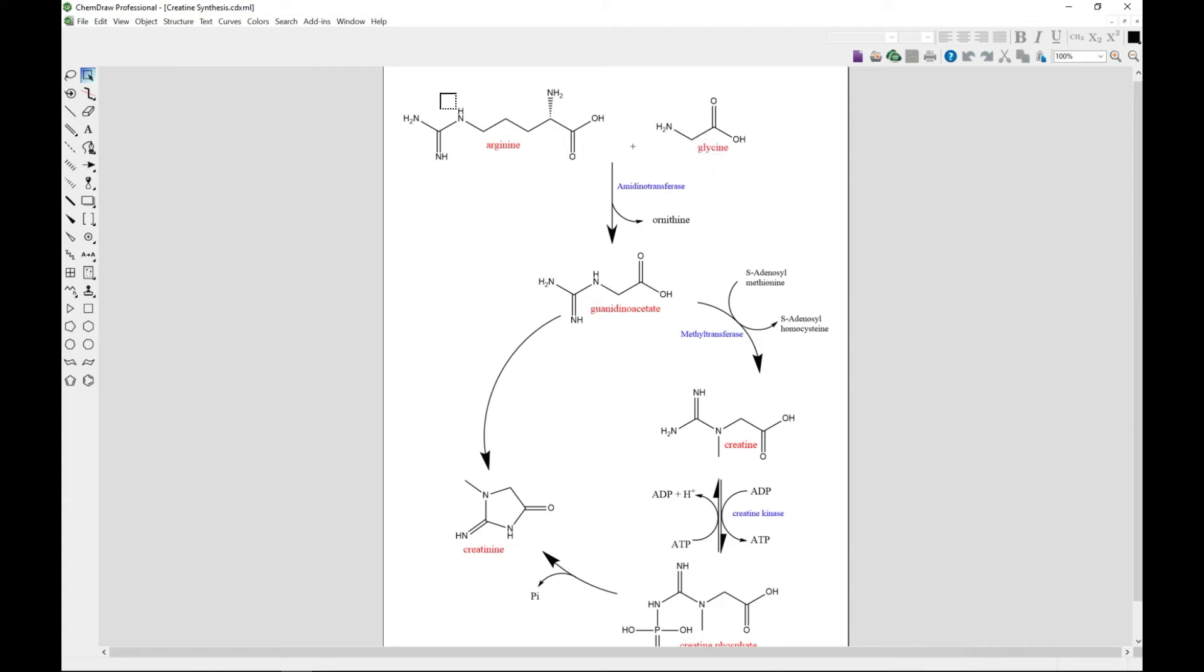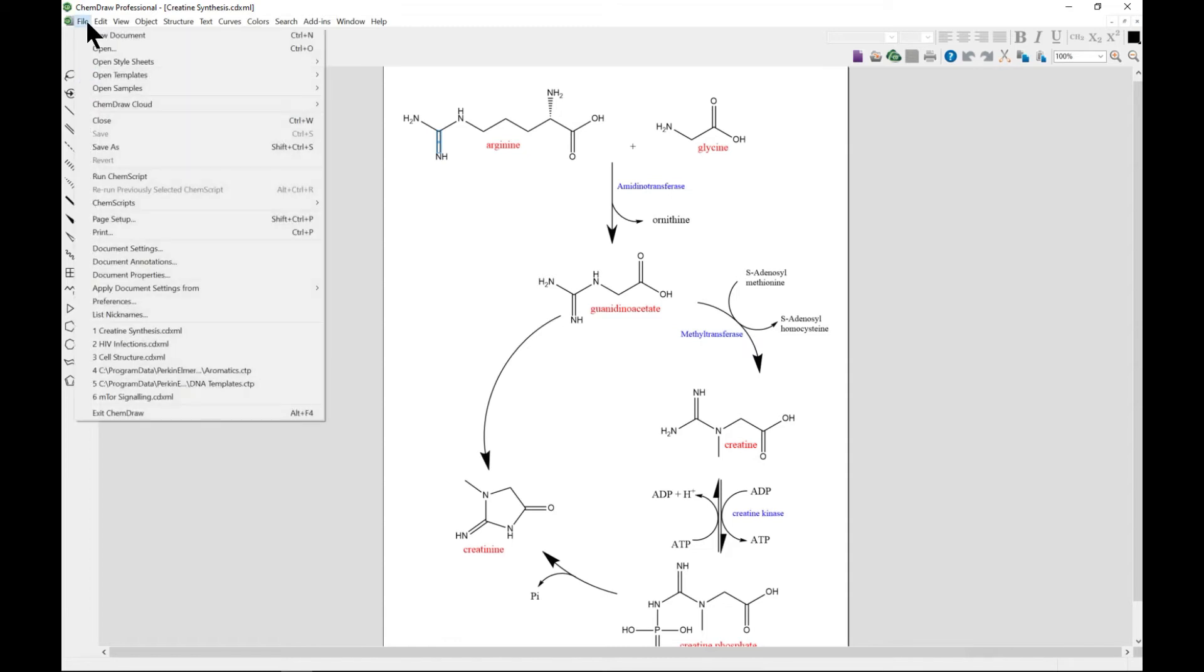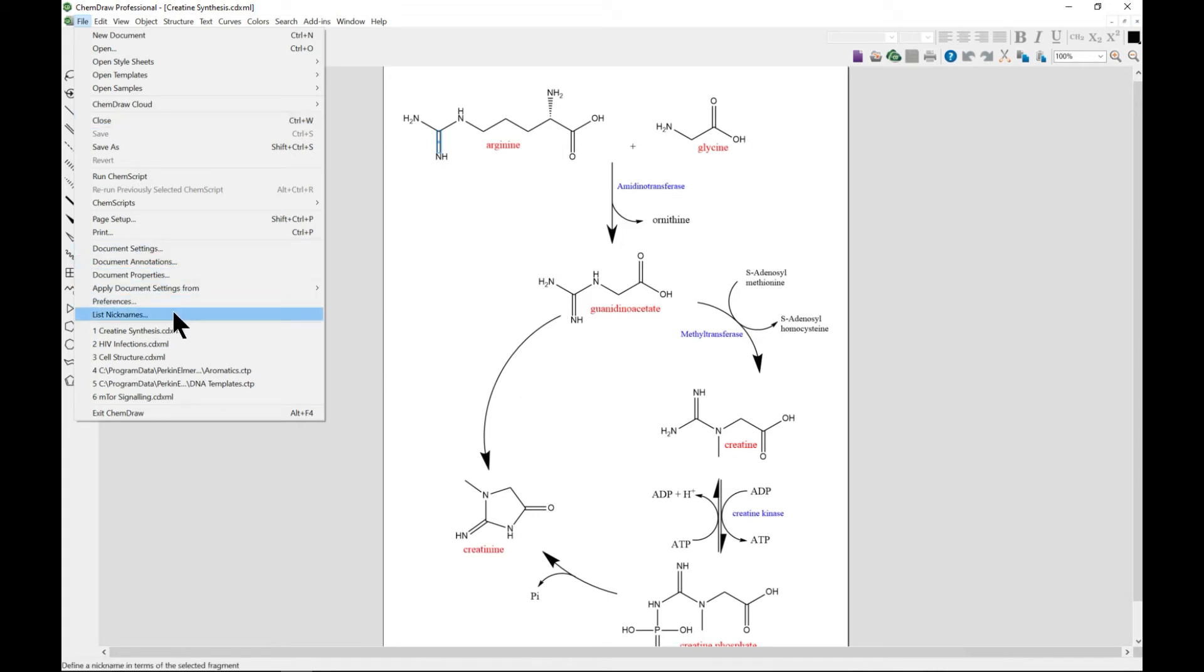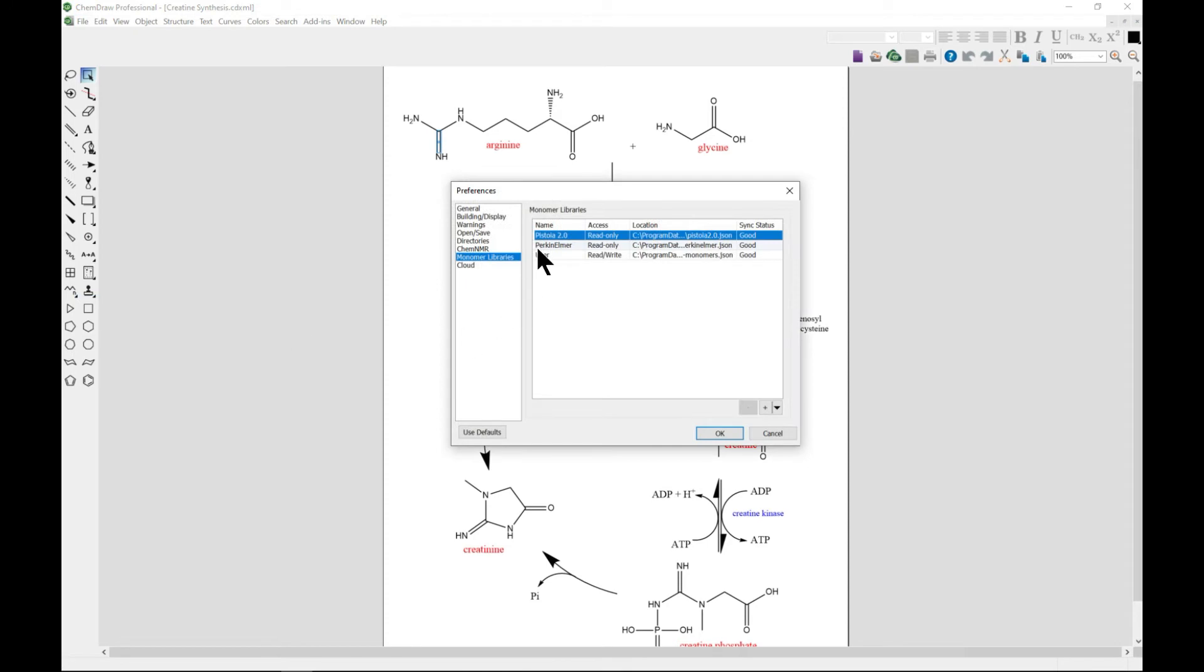You can always edit it, change bonds, play around and make it very interesting. Another thing to note is you can have a lot of preferences when you come to File and head to Preferences. There are so many things that can be done here.